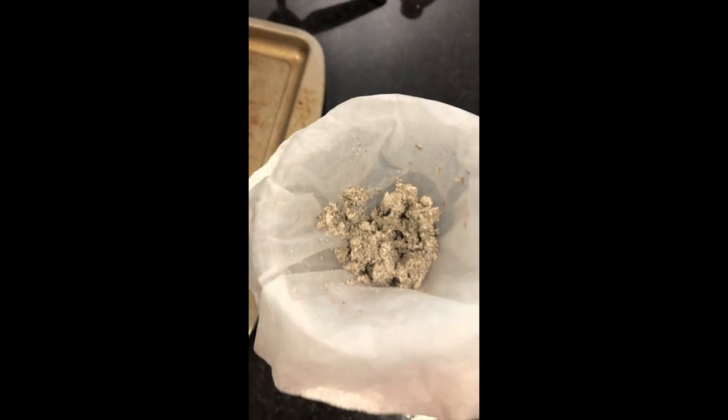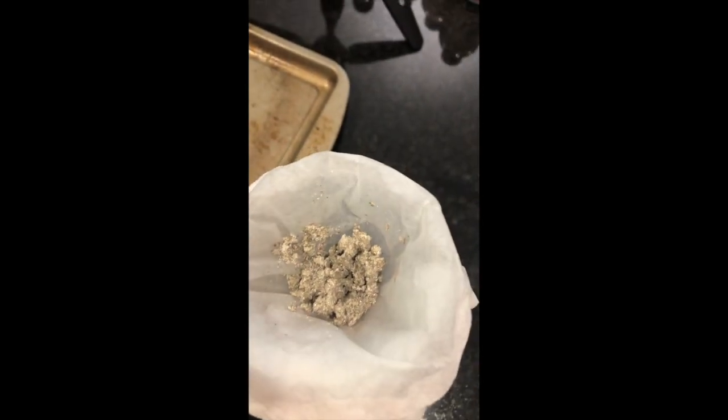Now for the silver here, it's all soggy itself, plus the paper is soggy. So to find our mass of silver, we've got to let it dry. So I'm going to throw it in my oven and let it dry for a few minutes, and then we'll pull it out and get a mass.